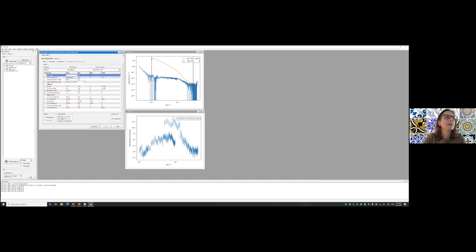And the background, we're gonna leave it as what it was. But you should set the scale to 1, and the reason why you should do that, that's why it looks so wrong at the moment, is because otherwise you'd be applying two volume fractions, right? You'd be multiplying twice. So if I set that to 1, you can see that it brings it down to a more reasonable value. Now the background, we're going to leave it at what we already had.